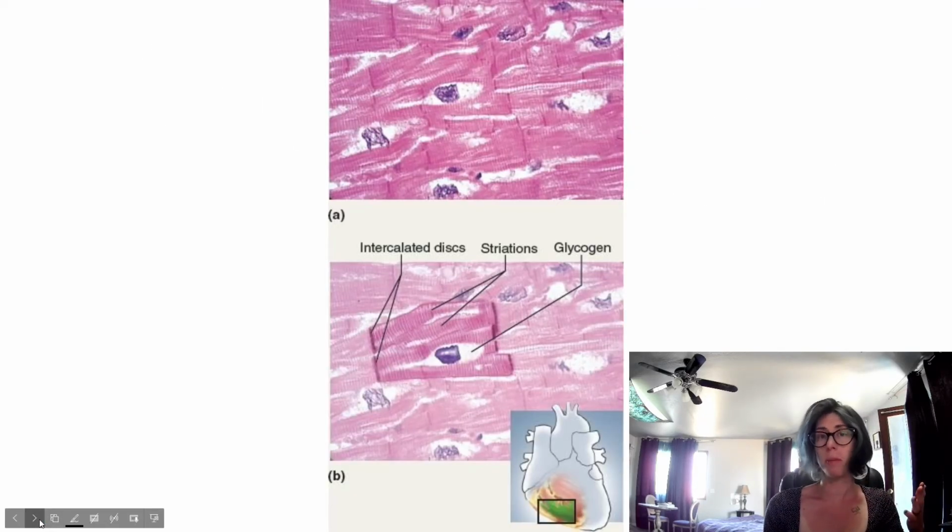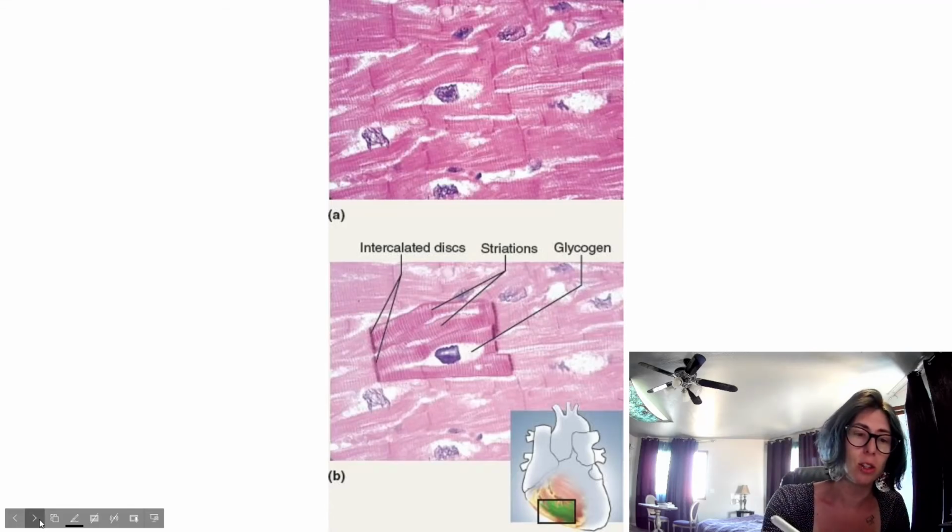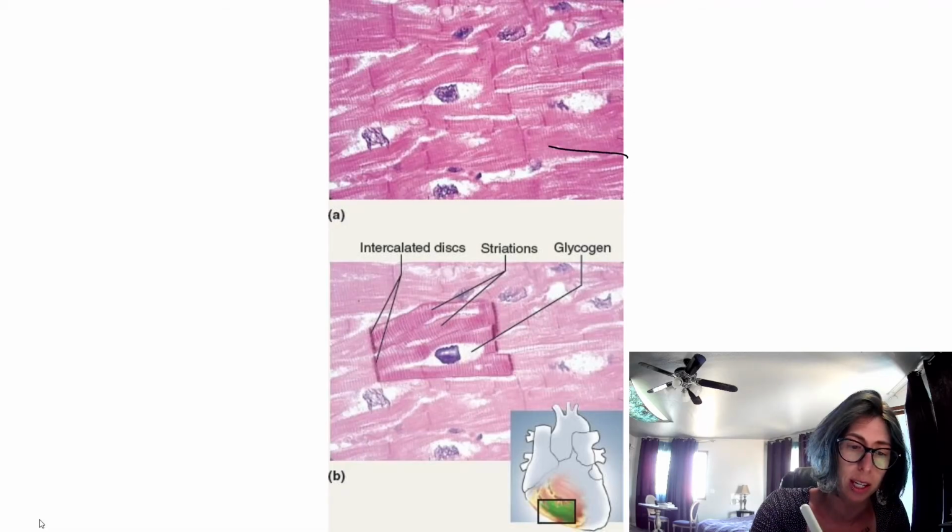Here's more microscopy images. Again, these are just from Google image searches for cardiomyocytes microscopy or cardiomyocytes histology. Now you can see again these nuclei. These are other ways these muscle cells can look. So you can see intercalated discs here. You can see this branching pattern, right, of these cells.